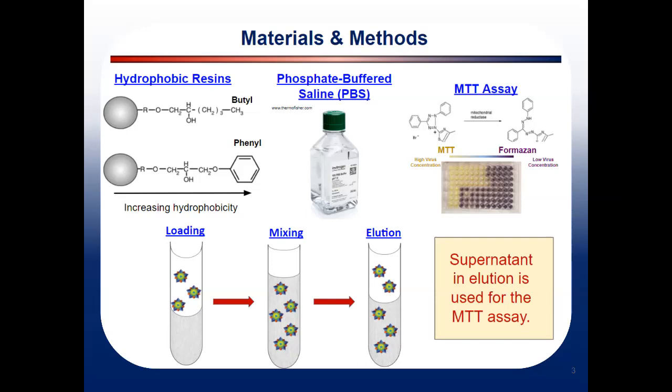The virus is loaded into a tube containing the hydrophobic resins and mixed thoroughly. This ensures that the resins and virus get the maximum amount of interaction. After mixing, a supernatant is allowed to settle above the resins. This supernatant contains the unadsorbed virus and will be collected for the MTT assay to measure the extent of adsorption.